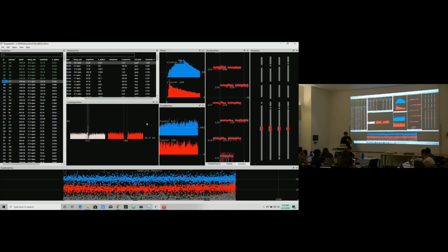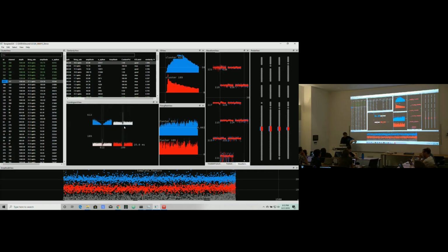And if it's not a Poisson process, but it's like this blue one that seems to be a lot more likely to fire some, I don't know, some 25 milliseconds after it's just fired, that's less of a Poisson process, and then also the correlogram looks like that too.